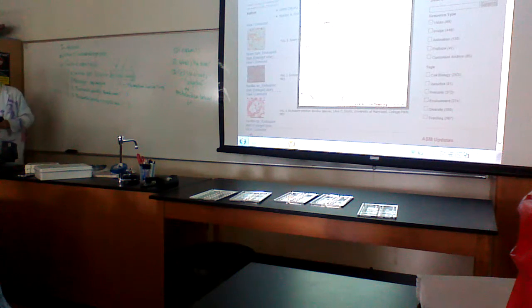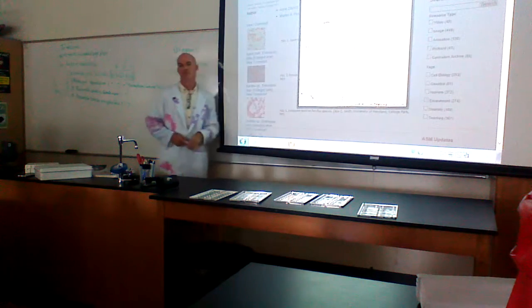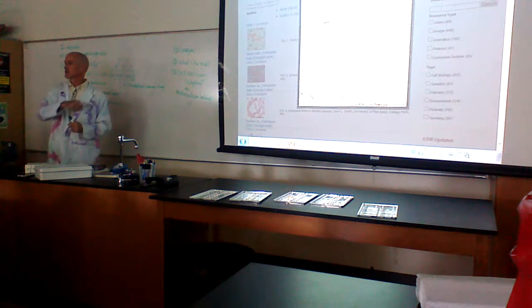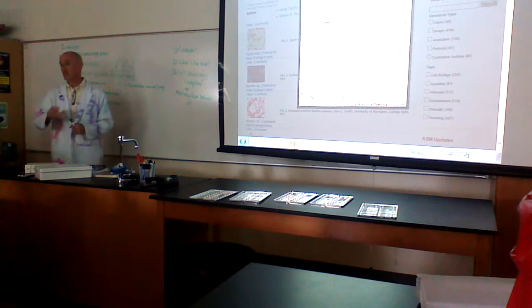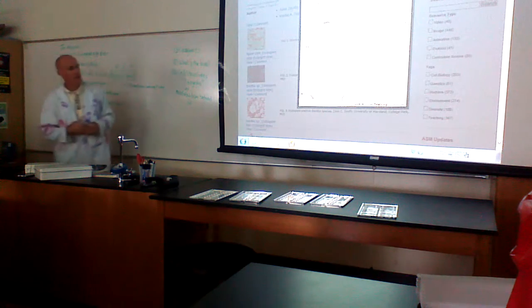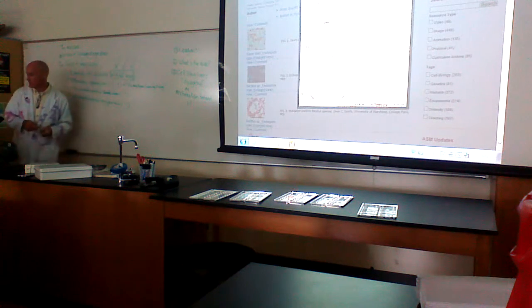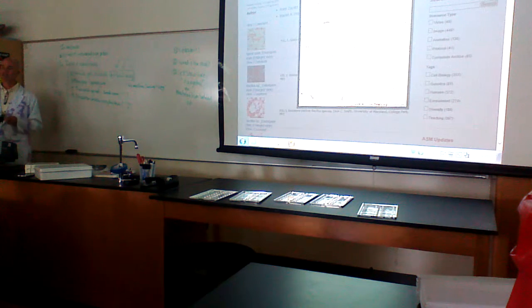There you go. All right, tell me about the bacteria that did this. Why did they do this? The bacteria did it before you stained it. Right, they make spores. In nutrient poor conditions or a lot of cell stress, they form this. It's like a time capsule: stick my DNA in this time capsule, it's tough, it's environmentally resistant. These kinds of things you have to autoclave in a special way to get rid of them. They're very tough. In a hospital environment, you're most likely to run into these in terms of Clostridium difficile.